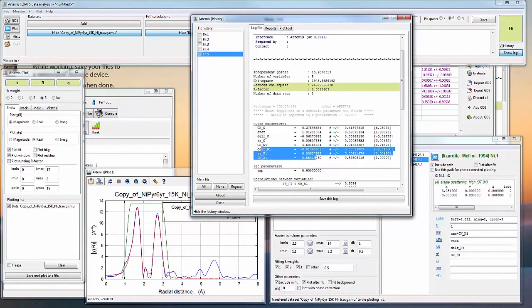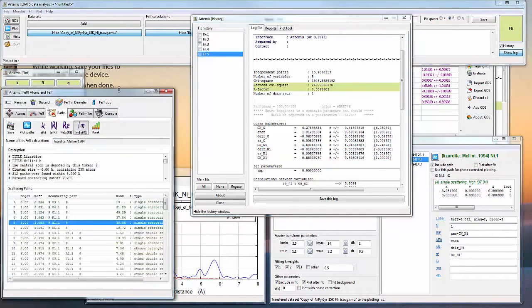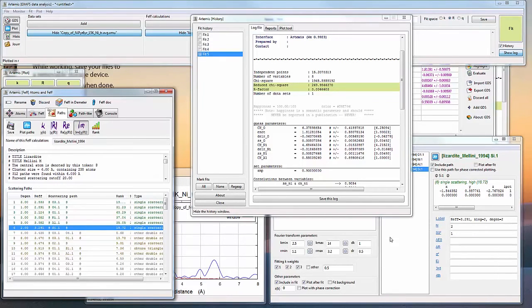Well, I know that over time silica or silicon also dissolves from the phyllosilicate mineral, the pyrophyllite, and can form a tetrahedral sheet adjacent to the hydroxide sheet of this sample of the layered double hydroxide. So if I go back into my FEFF list, I can select the silicon, and that's the distance of the tetrahedral sheet from the scattering central absorbing atom in the octahedral sheet, and it's still part of the second shell.